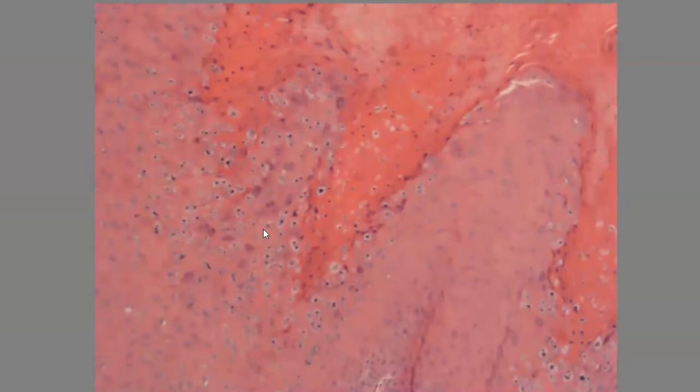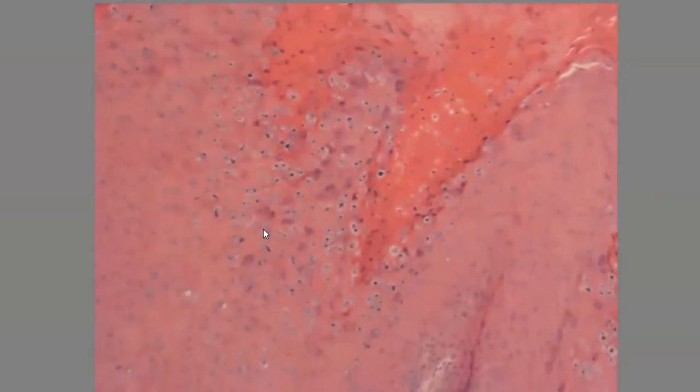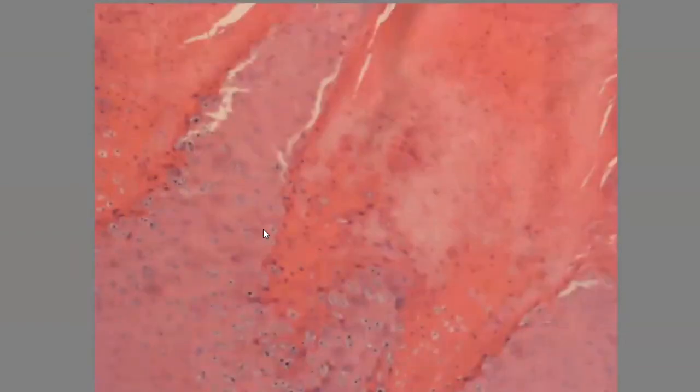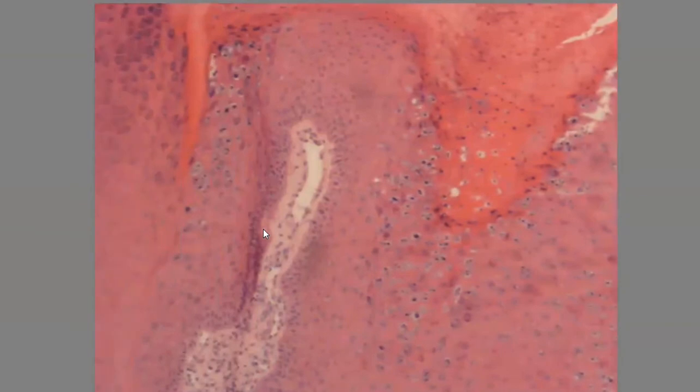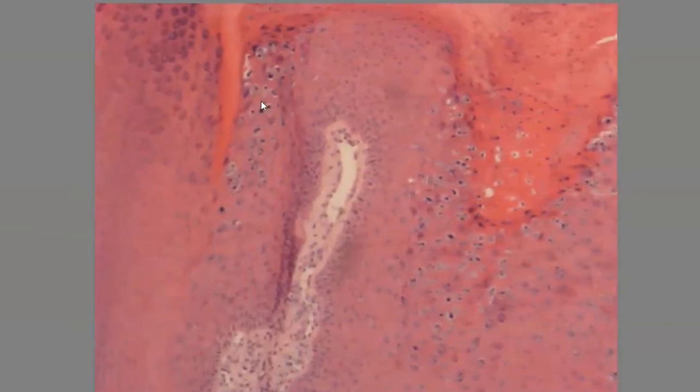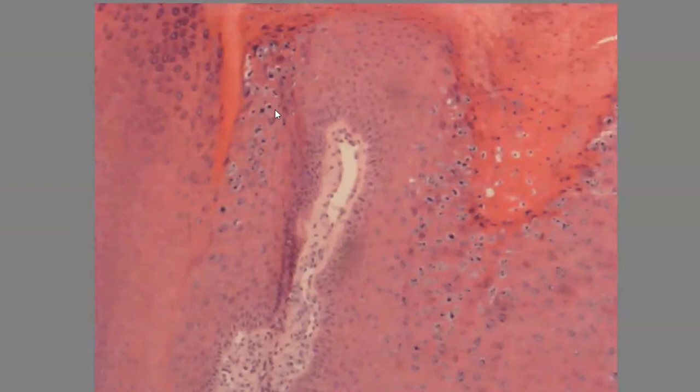We can see here also at this part, I want to show you some perinuclear halos that may happen at this layer, like for these cells. These are koilocytic cells with the perinuclear halos.